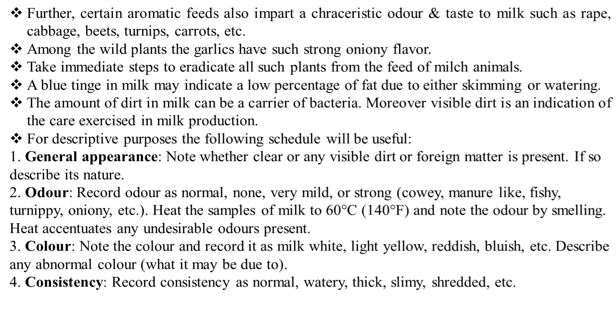A blue tinge in milk may indicate a low percentage of fat due to either skimming or watering. The amount of dirt in milk can be a carrier of bacteria. Moreover, visible dirt is an indication of the care exercised in milk production. For descriptive purposes, the following schedule should be useful.